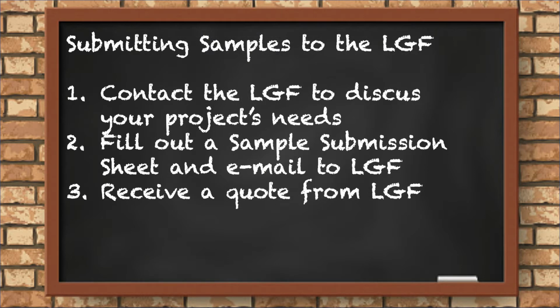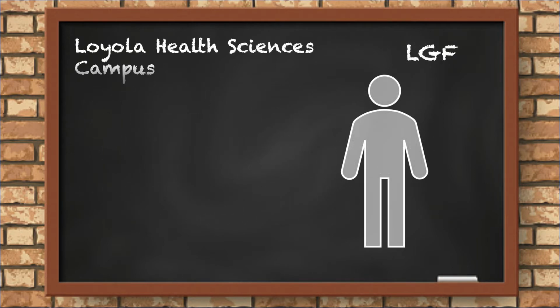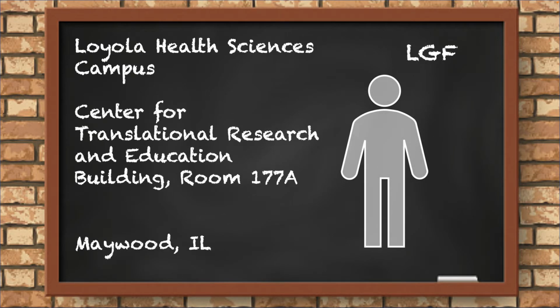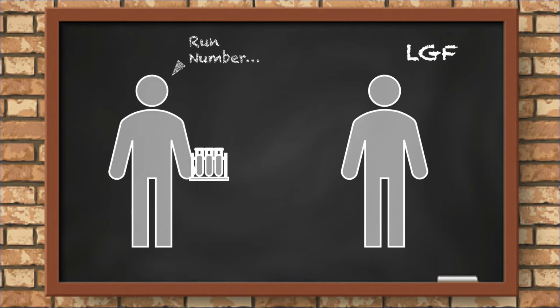Once you've reviewed your quote, you're ready to drop off samples. It's always a good idea to make sure someone in the LGF lab on the first floor of the CTRE is available to receive your samples. When you arrive, make sure you associate your samples with your LGF run number.